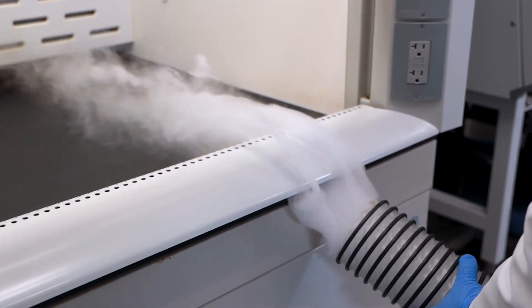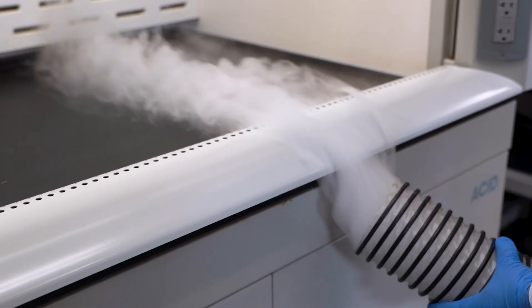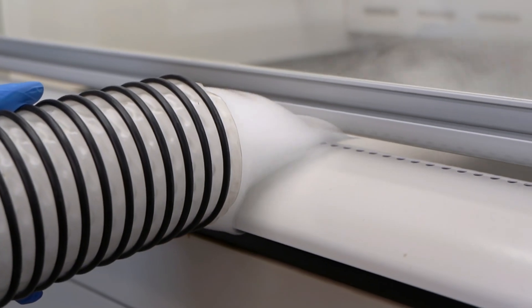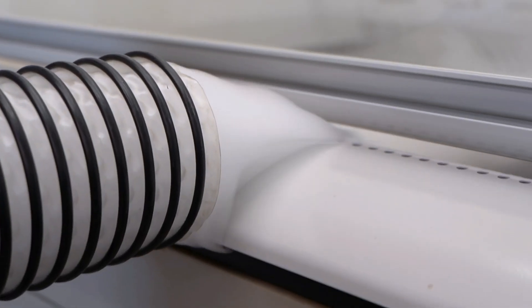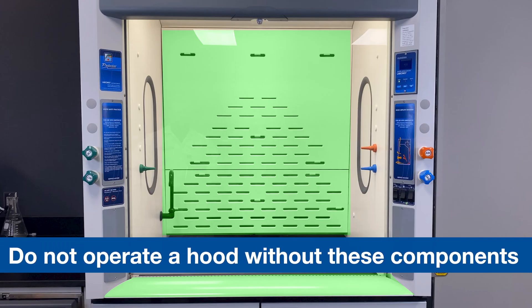The airfoil, or sill, is an aerodynamic component at the bottom of the face opening on the hood, which allows air to enter the fume hood even when the sash is fully closed. The baffle and airfoil are critical performance features of your fume hood. Do not operate a fume hood that has had either of these components removed.